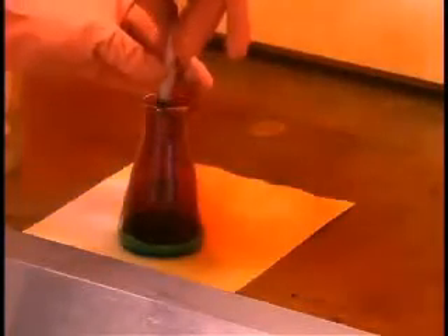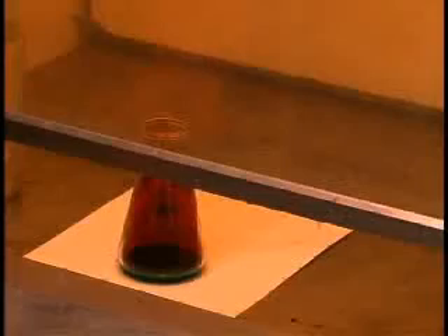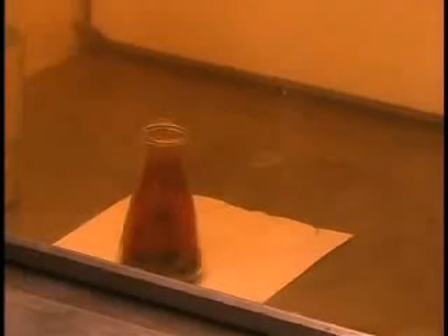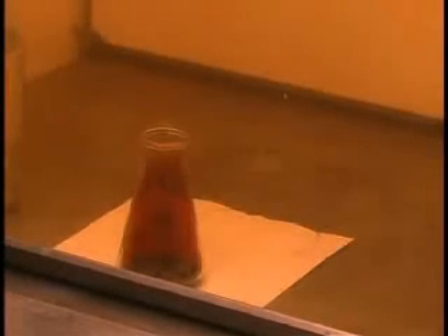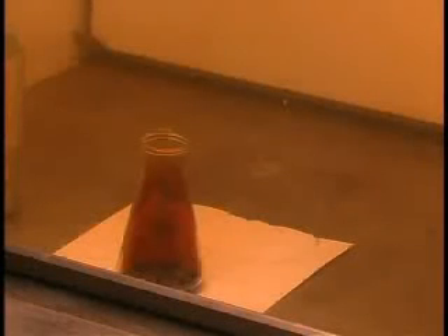I want to capture some of this gas for a later experiment. You can see that the gas is settling in the flask. It's denser than air, so it will fill that flask and sit in the bottom very much like a liquid. Normally you can't see that with gases because most gases aren't colored.